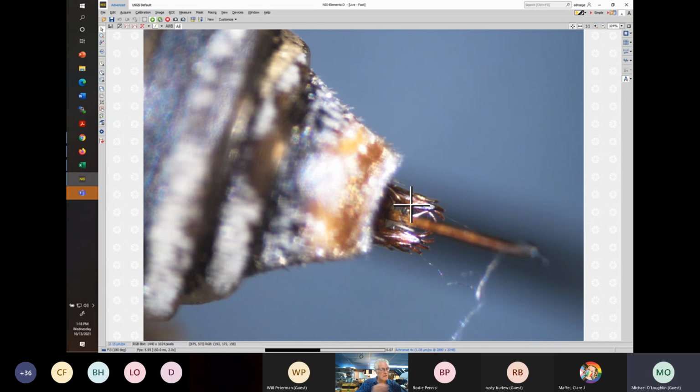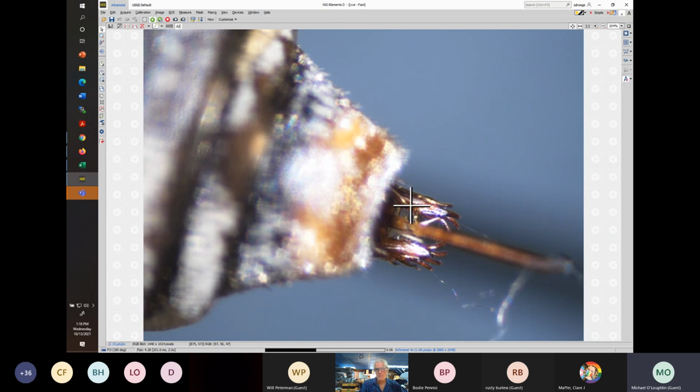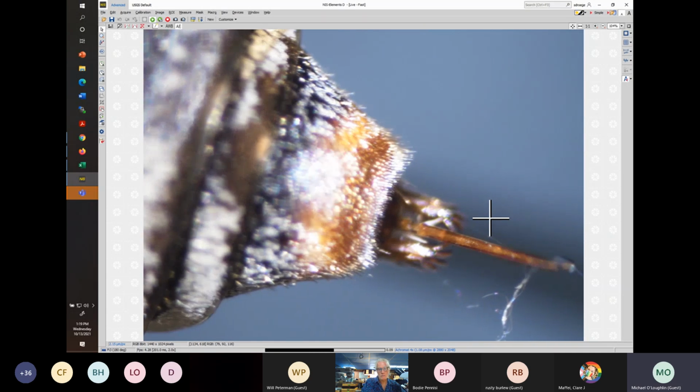And what you'll see, I'm going to add some more magnification. That's about all I can get out of it, is these have these little setae sticking out along their edges. This is like a little knife, I would say. It's flattened, knife-like, and quite long. It'll go back to there. So when completely extended, it'll come out to something along those lines. But the end is not expanded, not spoon-like, like you would find in Epeolus. Again, just seeing that makes it Epeolus, but the problem is that a lot of times you don't see that.